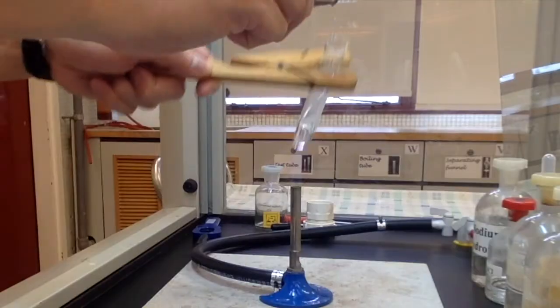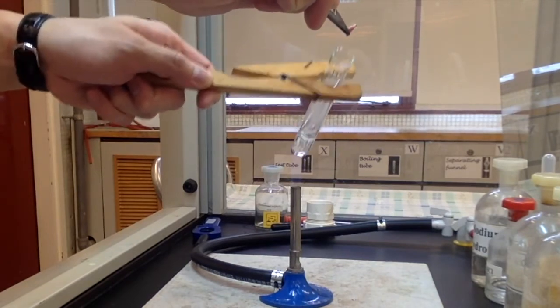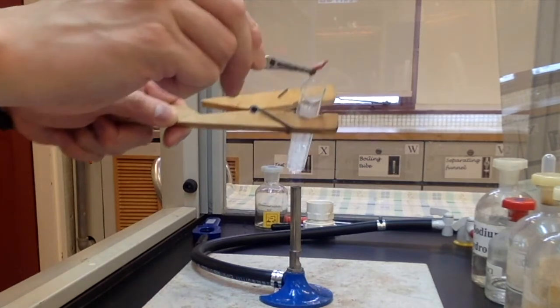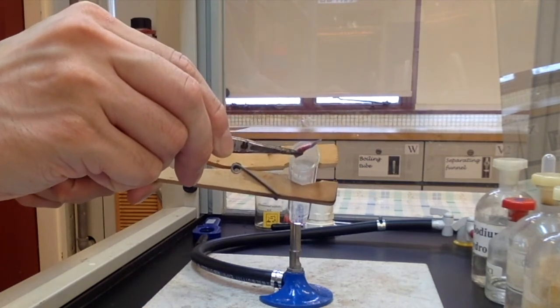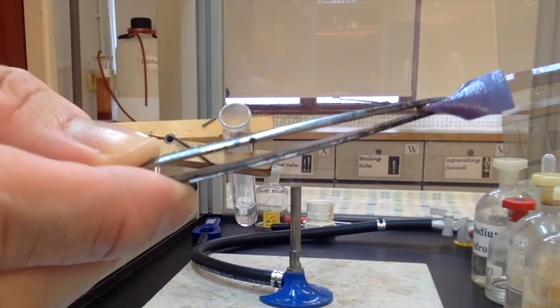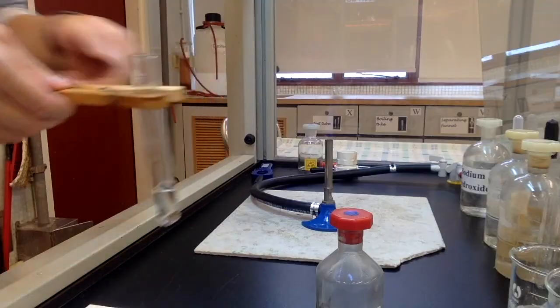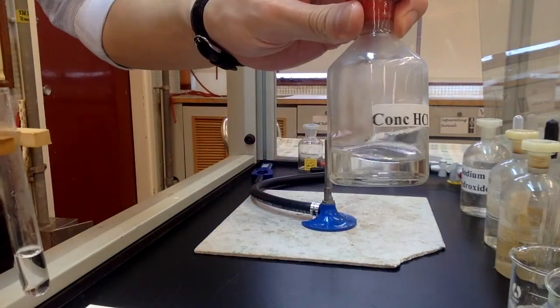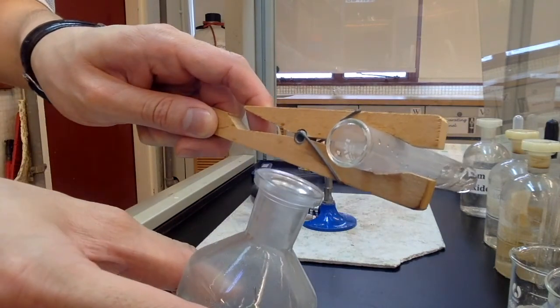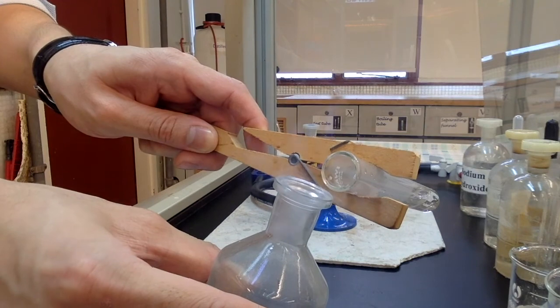Heat the reaction mixture and place a moist red litmus paper next to the mouth of the test tube. The red litmus paper changes from red to blue. Place a bottle of concentrated hydrochloric acid next to the mouth of the test tube. Dense white fume is observed.